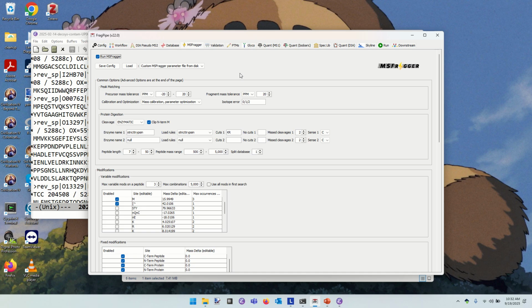And for a long time, when people said, I need to do database identification, they were just talking about the database step. The pieces after this actually take just as much time as identification does now. But there are some broad things that we need to talk about here.